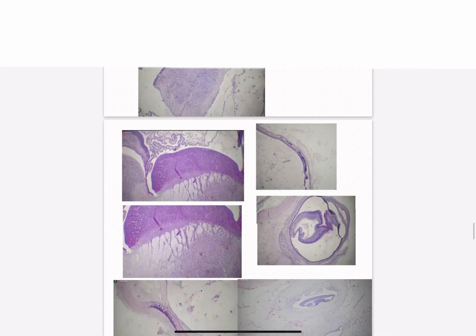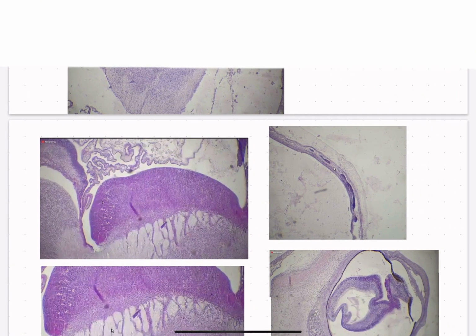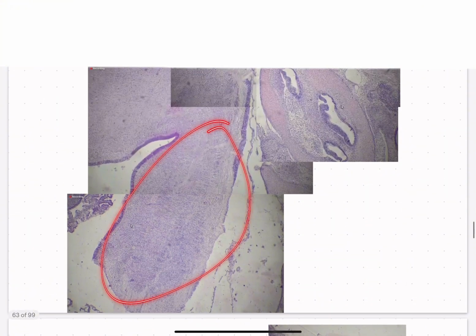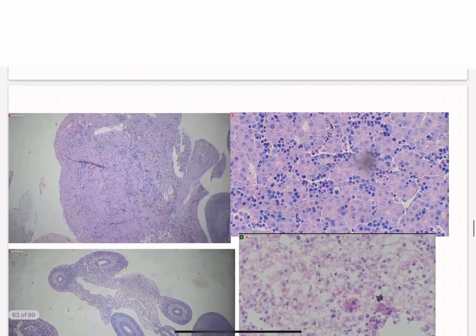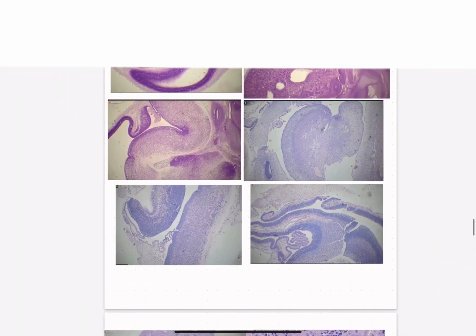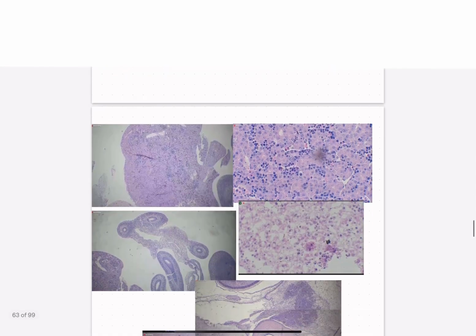I'm just going to say that if you see a wiggly kind of structure, you know that you're within the general brain area, and it's next to the nucleus caudatus, next to the medulla oblongata, but could also be next to other adjacent brain structures like it is here. It's an easy guess to assume that it is the plexus choroideus.